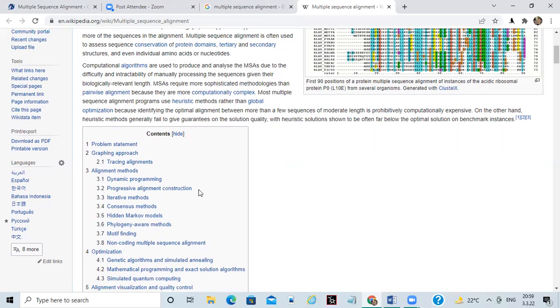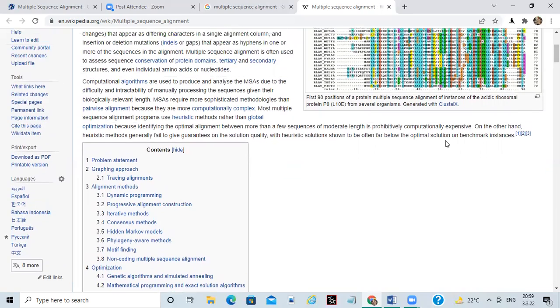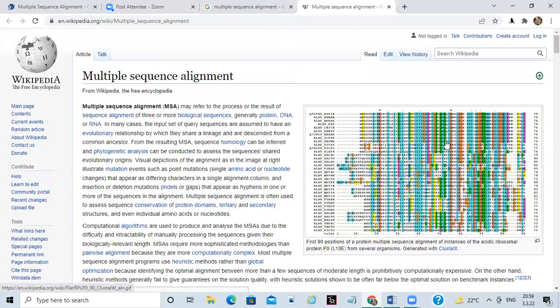So these are multiple sequences. You can also compare a small sequence, a stretch, or we can go for a complete sequence comparison. So it is highly used to create the phylogenetic tree, if you want to confirm the evolutionary analysis or find hidden motifs among the sequences, to find the functional domain.